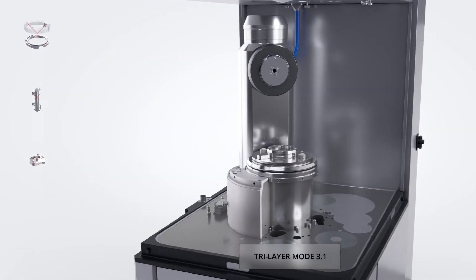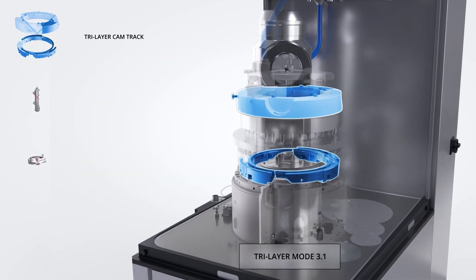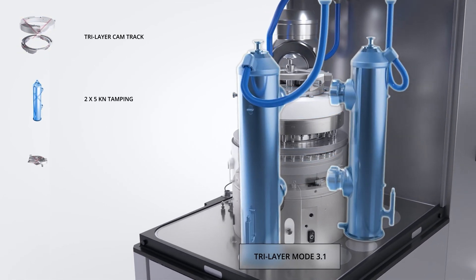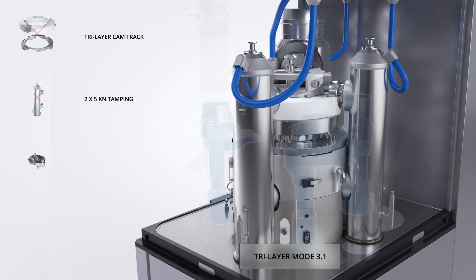Tri-layer mode 3.1 is ideal for all tri-layer applications, offering a tamping station after each layer feeder and a heavy tonnage main compression capability.